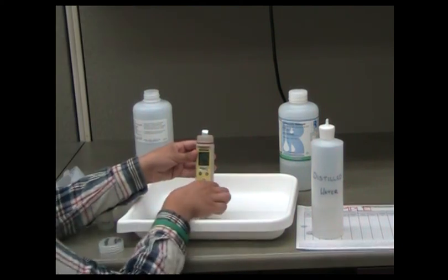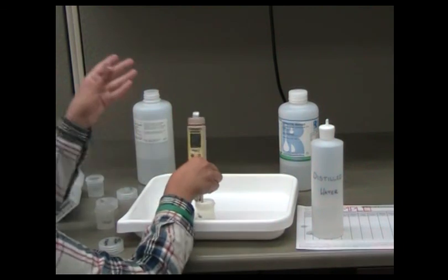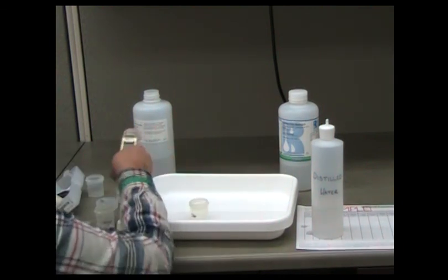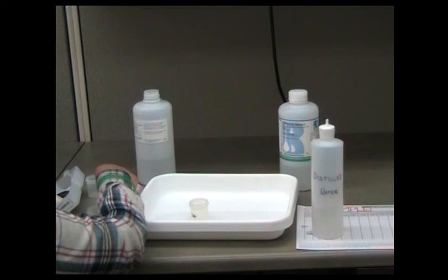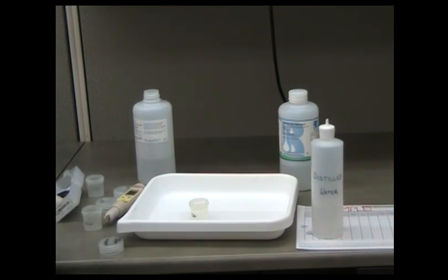You may turn the meter off and head into the field to collect your data. If you encountered any issues during the calibration process, please contact your local coordinator or WAVE staff.